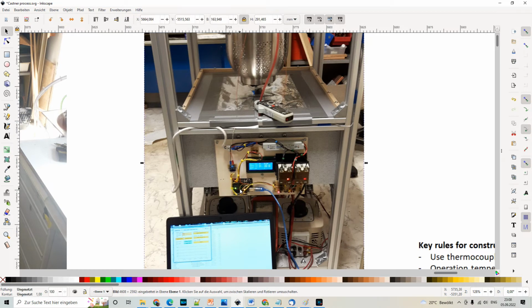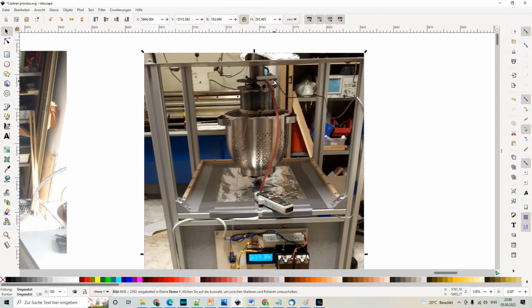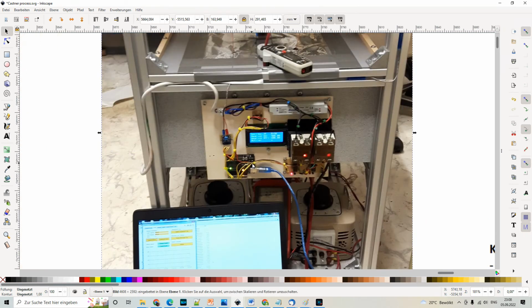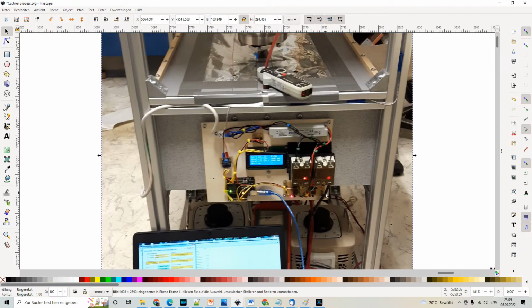This Arduino microcontroller was reading the temperature from a thermocouple, and basically simply processing those values and controlling the power to the external heating and to the electrolysis. So you see that I have here a relay and here I have a relay. So two relays. One relay is for controlling the external heating and the other relay is for controlling the electrolysis. So you need to have at least these two channels to control the power.